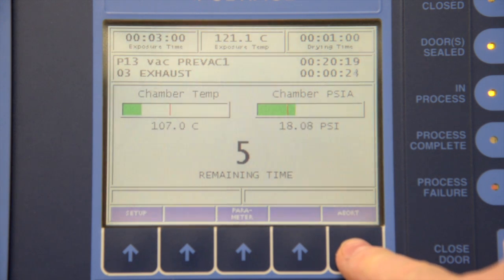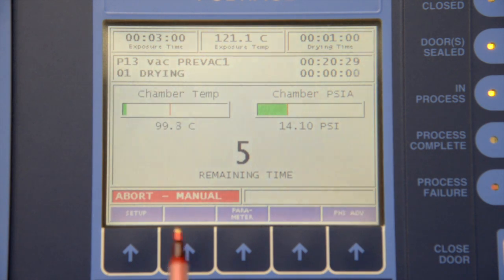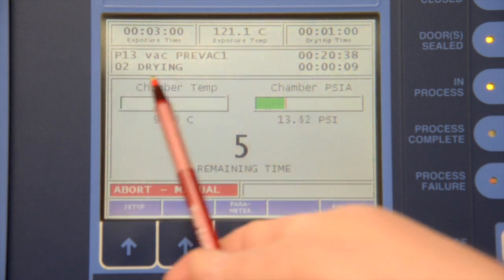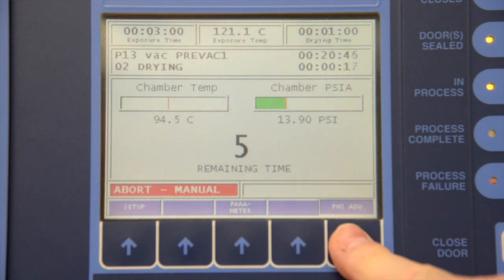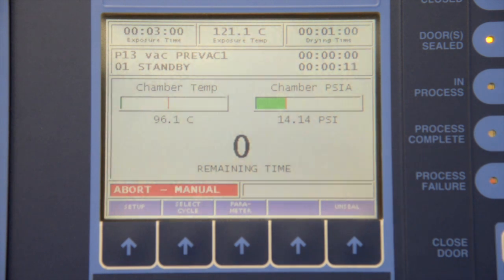At this time we will abort the cycle. When you abort the cycle it goes to the end of its cycle. You can see a red indicator that says 'abort manual,' which means I've manually aborted the machine. We're in the drying phase — simply phase advance through the drying cycle. We're now in air-in and back to standby. Because I manually aborted the cycle, the door did not unseal itself.